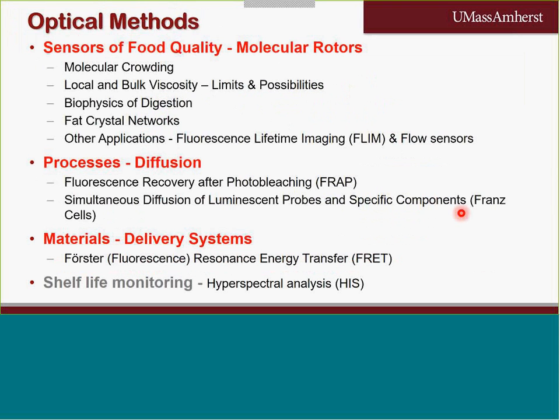In order to do so, this presentation will focus on four aspects: the development of sensors of food quality, particularly with the use of molecular rotors, which are characteristically sensitive to molecular crowding, which allows them to be sensitive to the local and bulk viscosity, and biophysics of digestion and fat crystal networks.